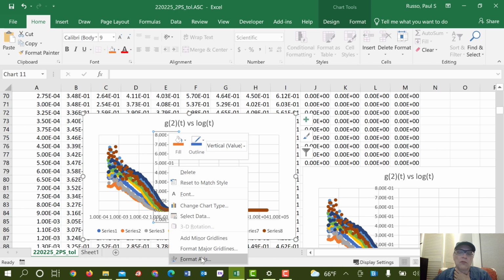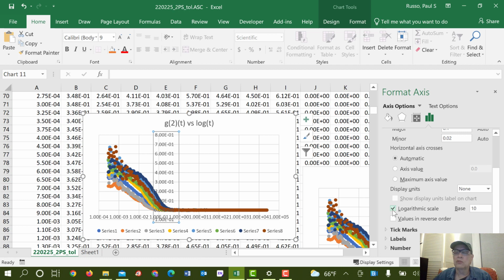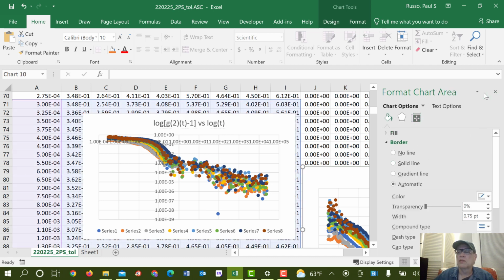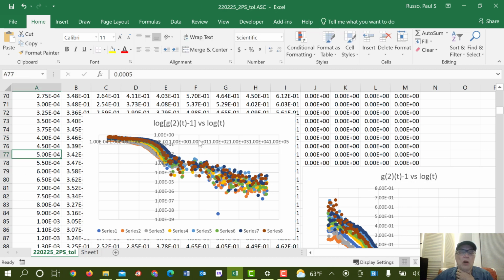And in this version, let's try to get the ln log one. Format this axis to be, the y-axis should be logarithmic. Yes, it complains. And now I've got the log plot. Okay, great. I wanted that, so I should do log. Change this. And I guess I'll put a bracket there or something like that. Oh, these should have been -1, by the way. So I have to fix that over here too. There it is. So now I have the log plot.